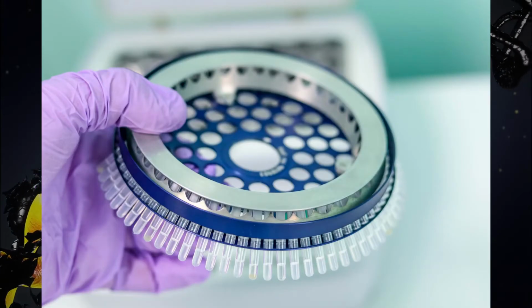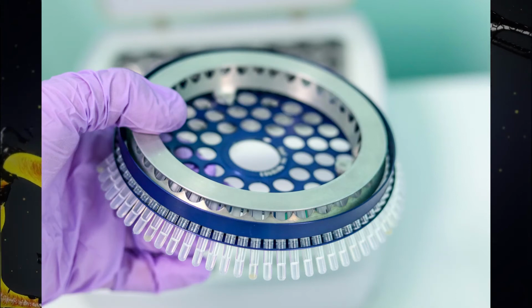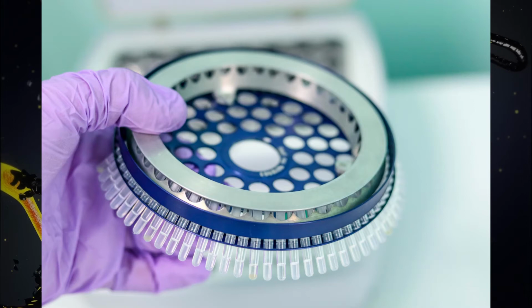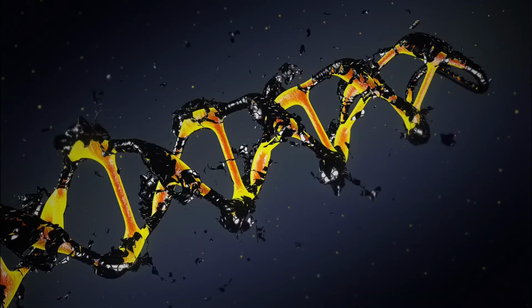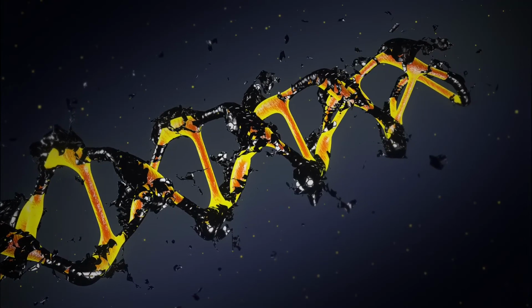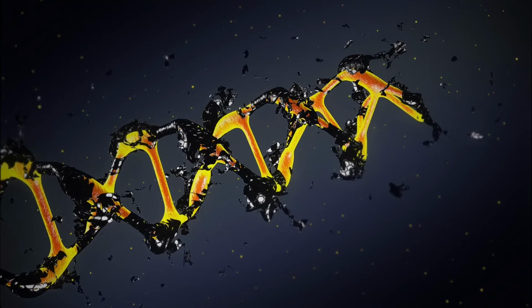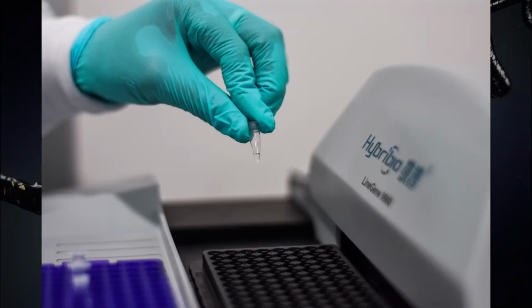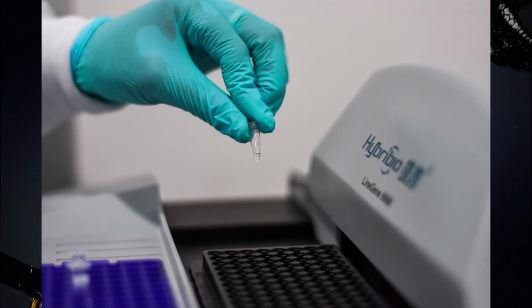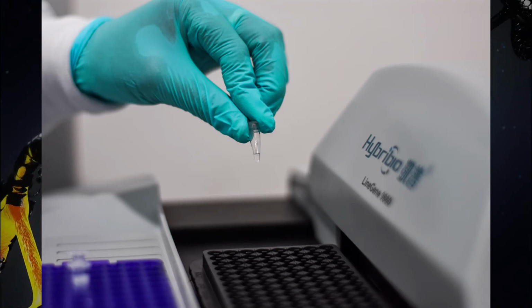Next, we'll look at what happens if, rather than looking at a single gene, you're trying to understand multiple genes simultaneously. This is known as a multiplex polymerase chain reaction. The multiplex part of this describes how you attempt to amplify multiple genes simultaneously. The difficulty with this particular approach is that you need to use multiple primers at the same time, but most primers require different temperatures to achieve that result.